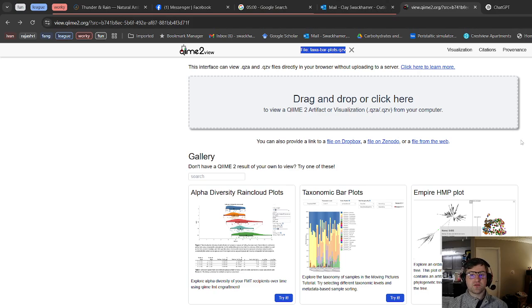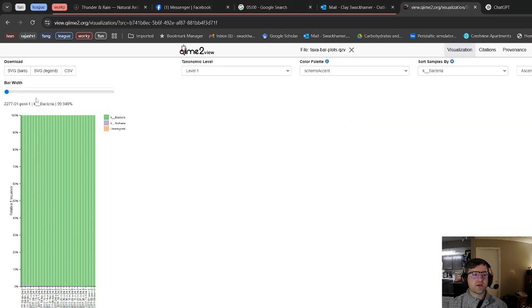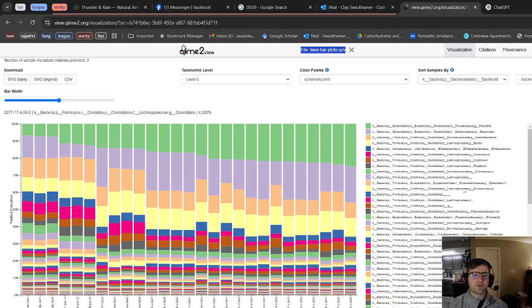And today I'd like to show a very quick demo for one specific AI-assisted task that I've been doing for microbiome data analysis. So starting out, we're in QIIME. This is a bioinformatics program. And I only want to do this step to show where I'm getting the data from, taking one of these output files from QIIME. If you're not a user of this program, just hang tight for a moment.